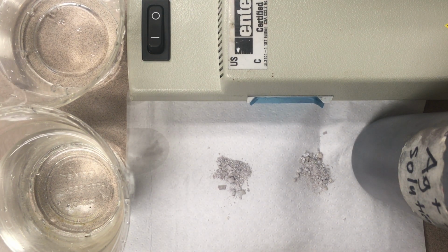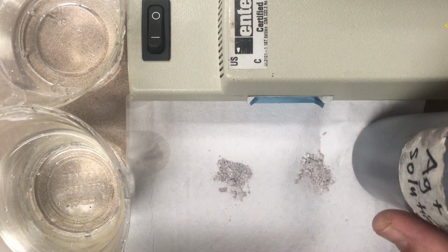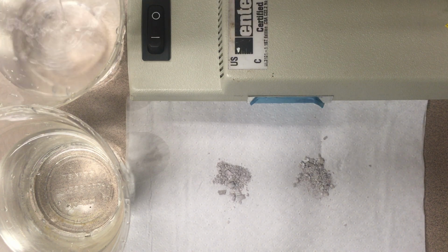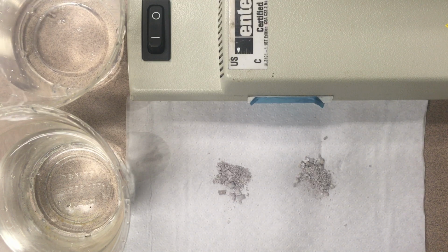We're going to show you a few things associated with silver chloride. First of all, we're going to make some silver chloride. We have silver nitrate solution here in this bottle, and we're going to add that silver nitrate solution to deionized water, and you can see that nothing really happens here because there should be no ions in the deionized water to react with the silver nitrate solution, so the silver nitrate solution is just diluted.